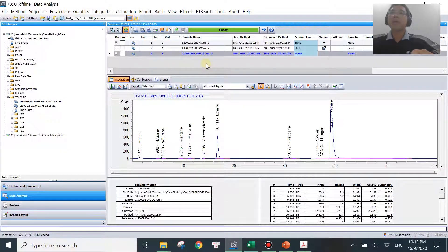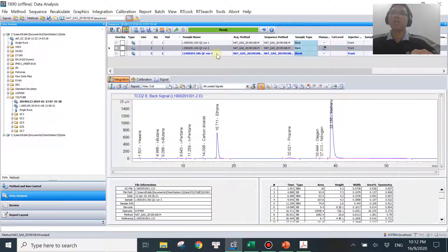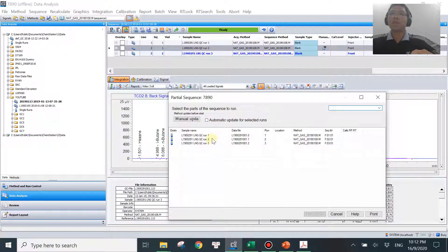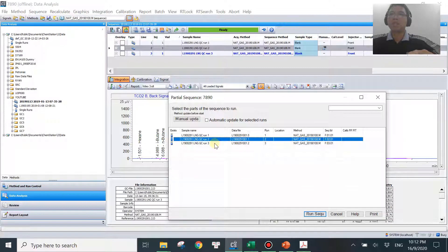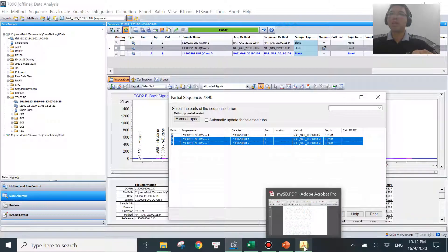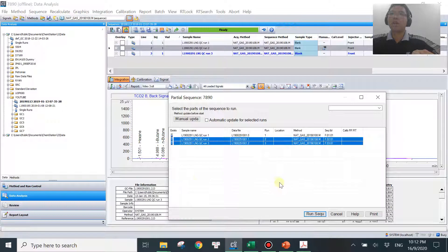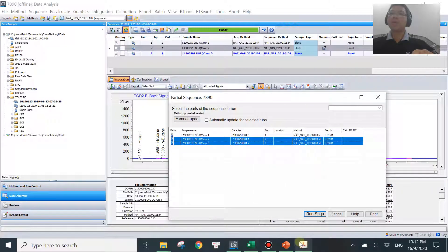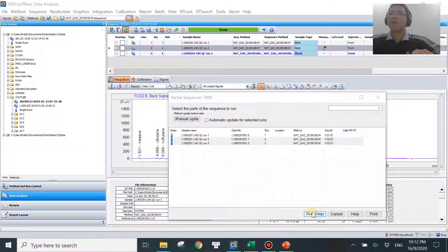In some cases you don't want to process all your data in the sequence. Let's say you have three runs but only want to process the second and third. Go to Sequence and select 'Partial Sequence', hit this button and it will show you the three runs. Select the first one, hold the Control button and select another run — number three. Hit Run Sequence. Before you do that, close the PDF file yourself, otherwise a new report can't overwrite the last PDF if it's still open. Close the PDF, then hit Run Sequence.